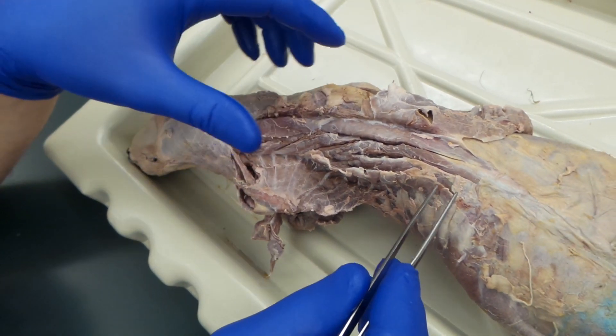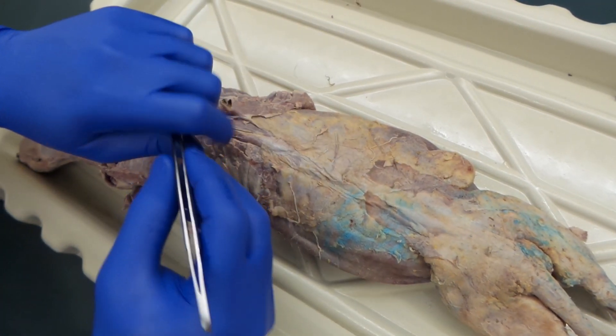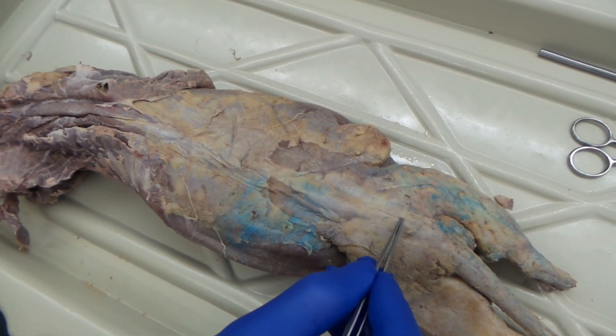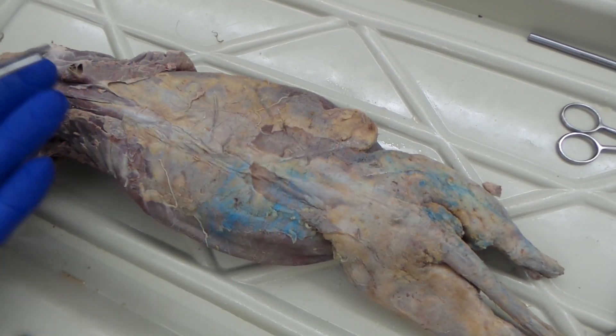In your manual, you also need to know the multifidus spinae. I didn't really dissect it, but you can see it right here. This line runs right along the spinal column. Multifidus spinae runs right along there, hugging the vertebrae.